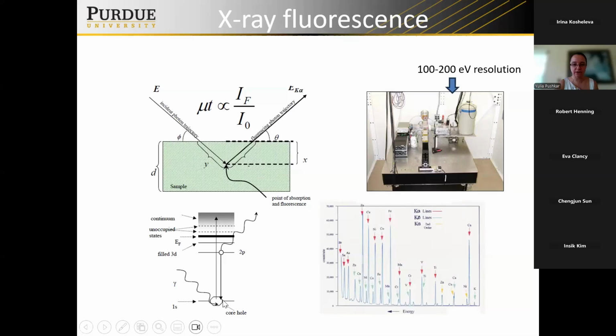Okay, so a photon comes in, excites, a photon comes out. So everyone knows it from optical spectroscopy. So here we're talking about an X-ray photon. The X-ray photon can be very hard, a high energy X-ray photon. It can completely ionize your atom. And we are talking about, as you see here, X-ray fluorescence for different elements, and some are biologically significant, such as copper, zinc, manganese, and iron, which we will be talking about.